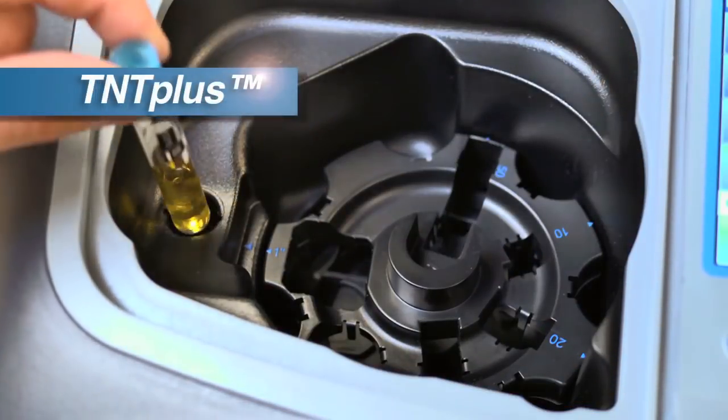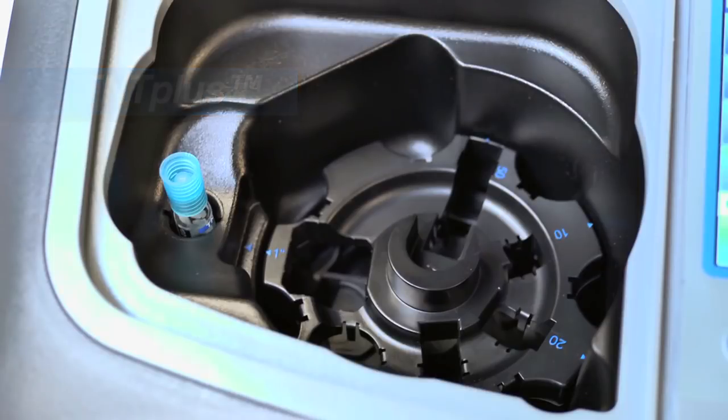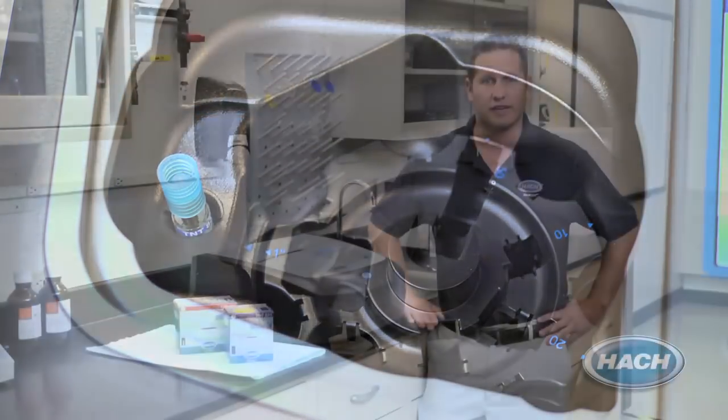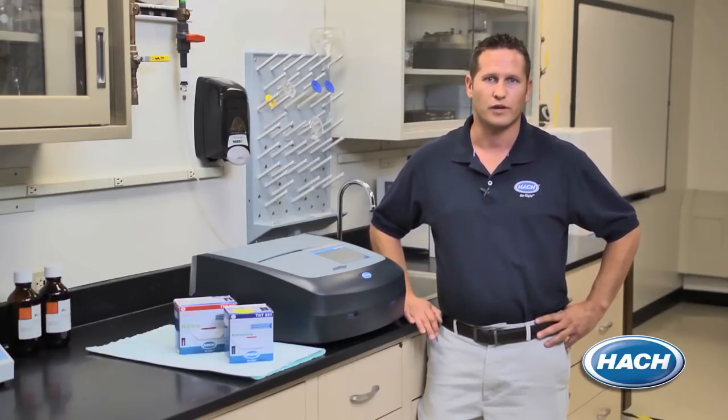There are additional benefits when using TNT Plus reagent vials with the DR6000. With the vials, the instrument will provide final results from an average of 10 readings during every test, which helps eliminate outliers due to scratched or dirty glassware.